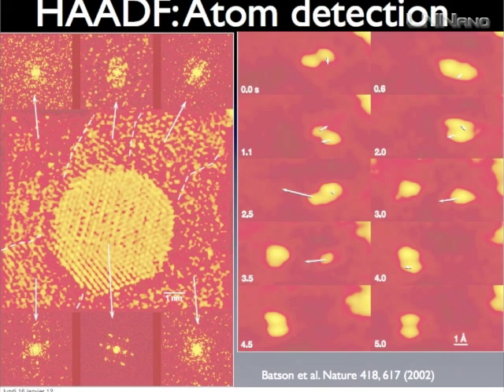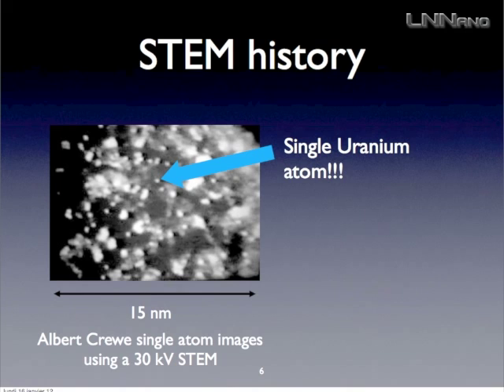So this is something that you don't have to forget, is that high angle annular dark field is especially a technique with a high sensitivity to heavy atoms. So it's very important. When I say it's easy, it's really easy. If you have the good machine, having 1 atom of gold is really easy. And if you don't have the good machine, you just have to take bigger atoms.